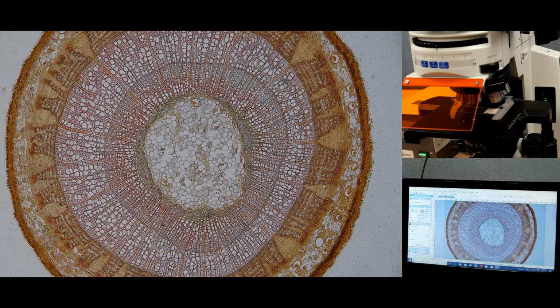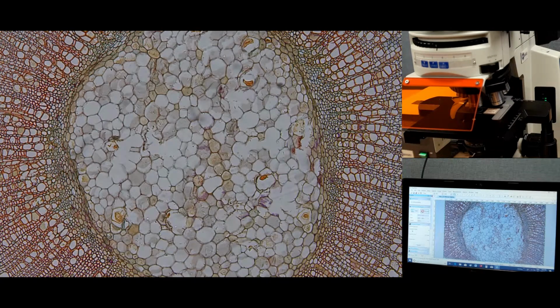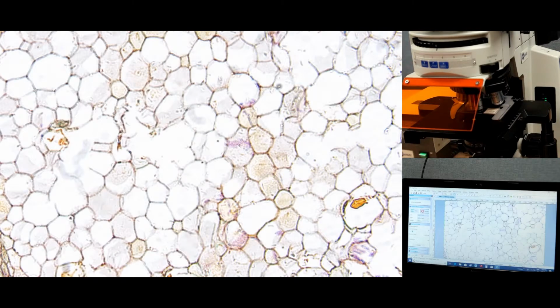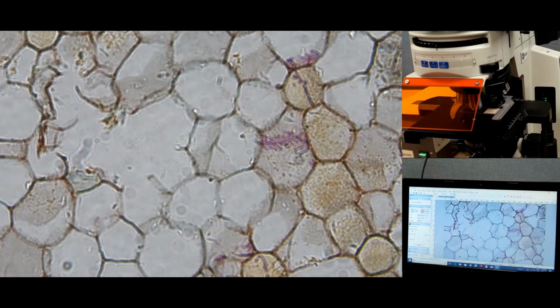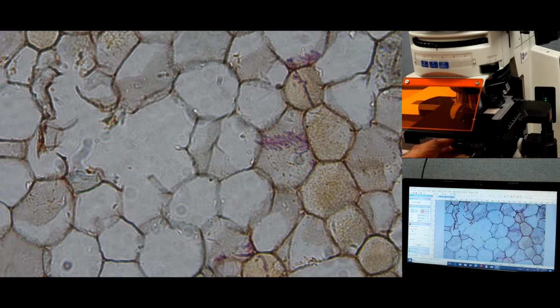We have connected a 4x objective lens. Now we switch to 10x. Next is 20x. The camera is set up at auto exposure mode. Switching to 40x objective lens, we may need to retune the focus a little bit.